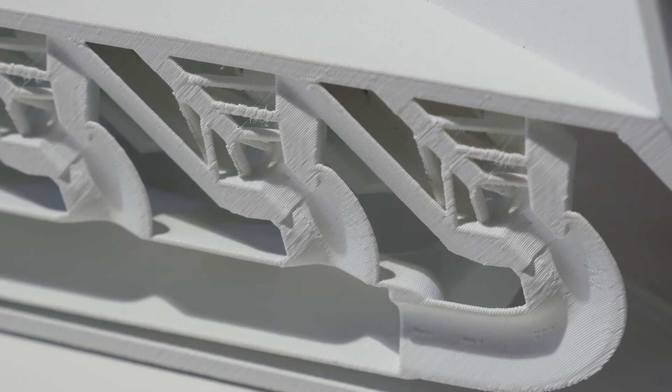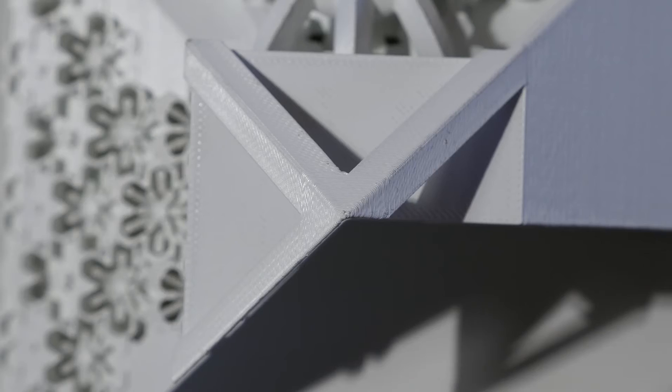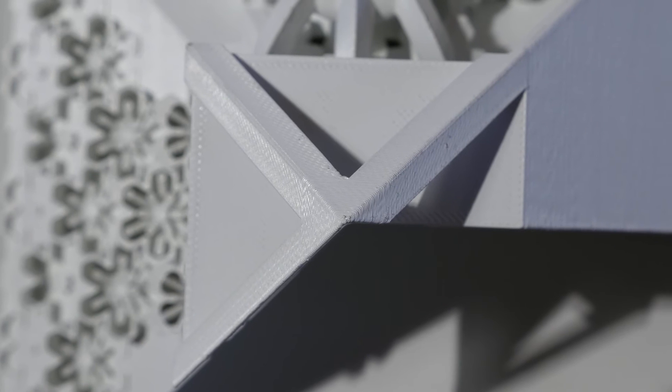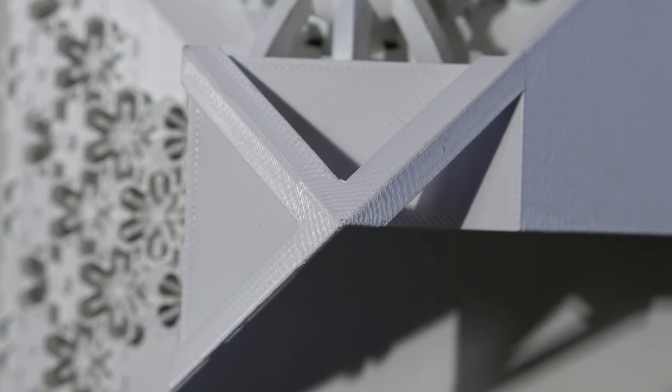And it started by questioning some underlying assumptions about how complex we should be making parts.